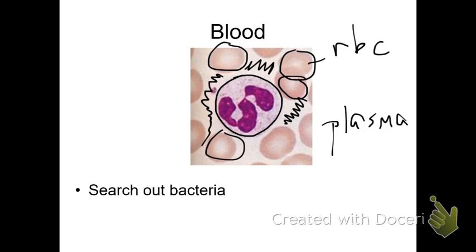Plasma. And in that plasma, there are proteins. And so because of that, blood is a connective tissue. Loosely arranged cells surrounded by stuff called plasma in which there are proteins. And those proteins are involved in blood clotting and things like that.